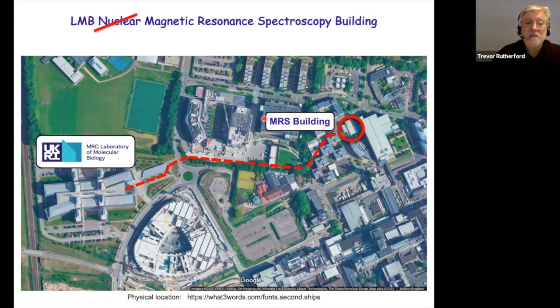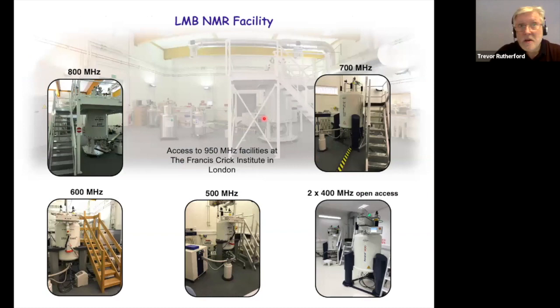The facilities that we have are exceedingly good. They're state-of-the-art facilities. We have at the moment 6 spectrometers. We've lost one this year. We've retired one that was originally put in in the late 1980s, and finally we retired it this year.